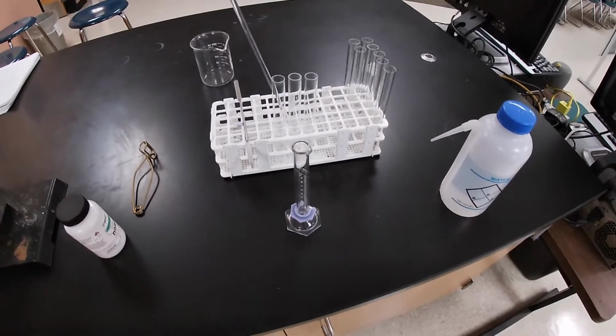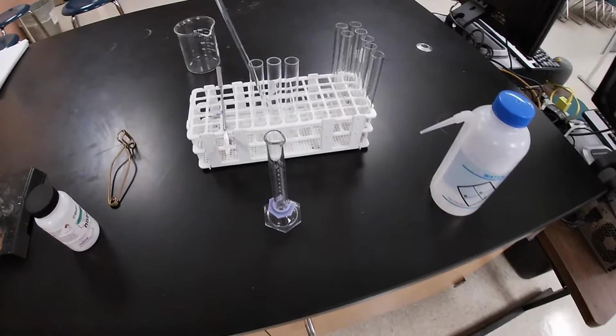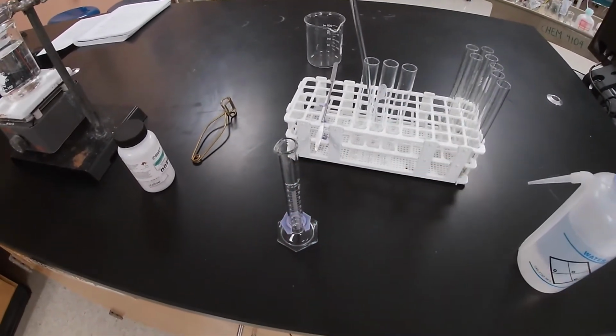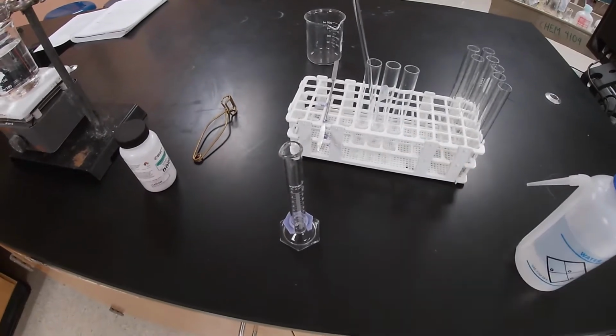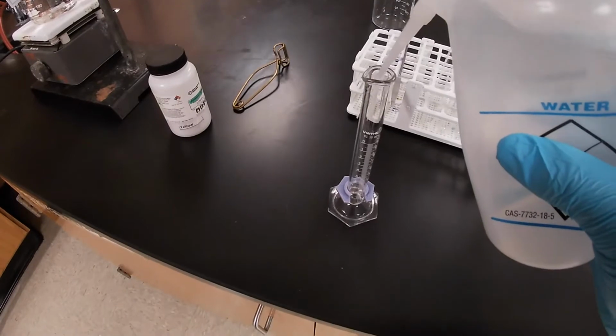But in this case, we don't have everybody working on this, so because of that, I'm going to give you 3 data points, and hopefully we can get a good, nice little graph with it. Since I'm going to do 3 data points, we're going to need 3 test tubes. I'm going to add 5 milliliters of water to each test tube.